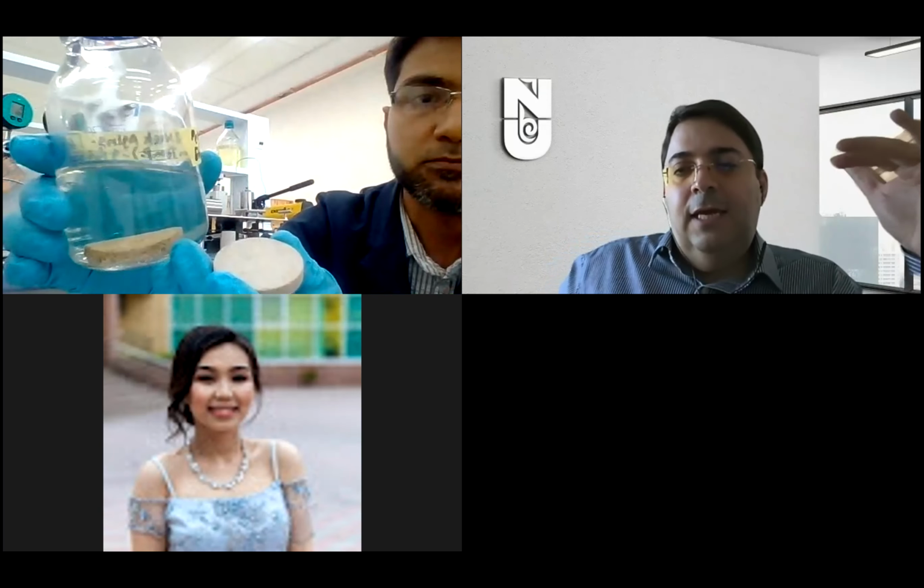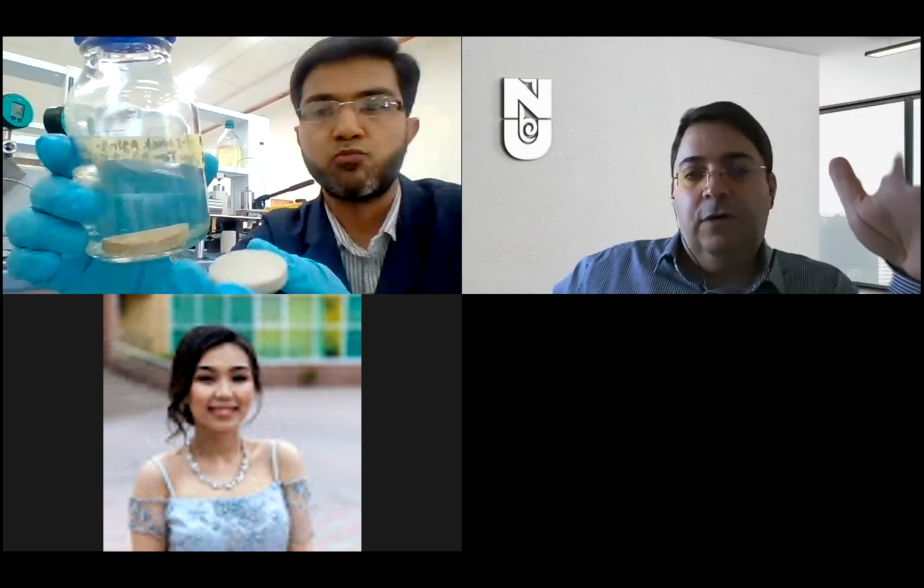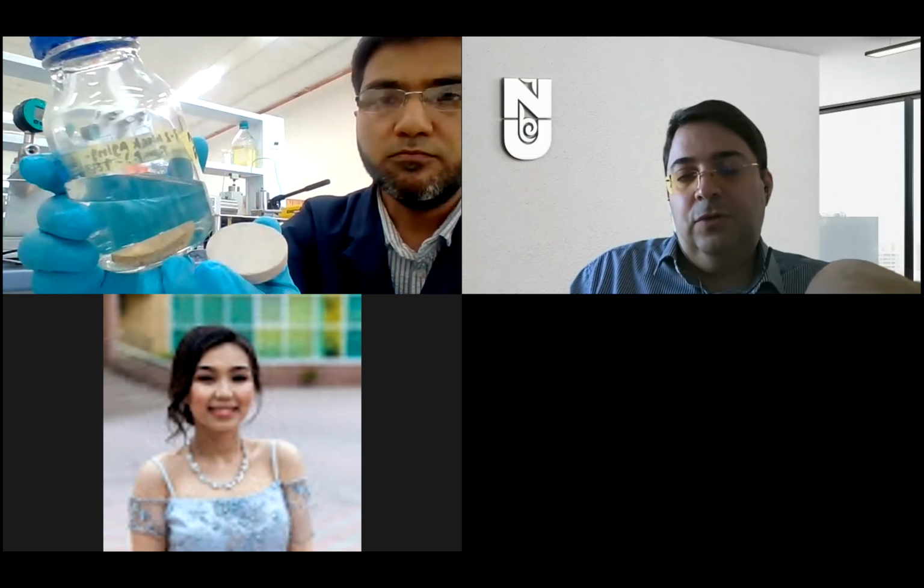Rizwan, I think your voice is not clear, so maybe I can explain. Okay, in this test we want to design one type of water. What does it mean? It means that we adjust the ions in a water. When we talk about seawater or water that we get from the environment, lots of salt and ions are in it. By adjusting them, we can make it useful to extract the oil. And this test is something that Rizwan is showing you, how we can check different types of water to extract oil from the system. Okay, continue, please.